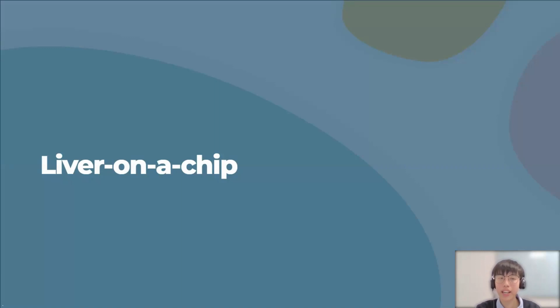In the following slides, I will be expanding further on how we model the human liver using our MPS technology and how this is able to resemble the structure and functionality of an actual human liver.